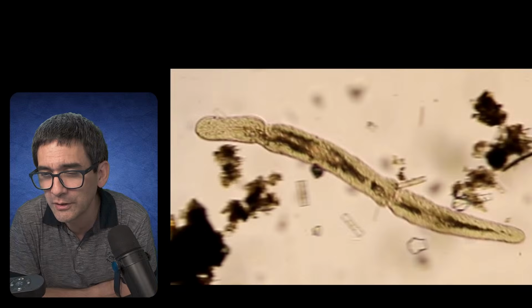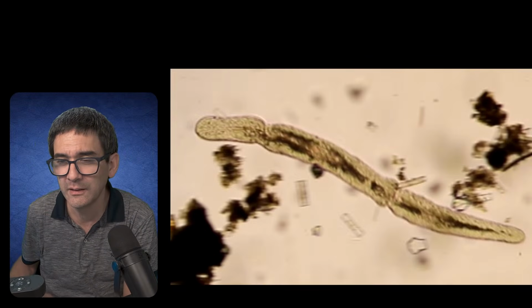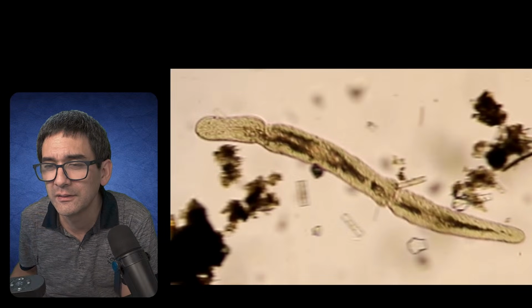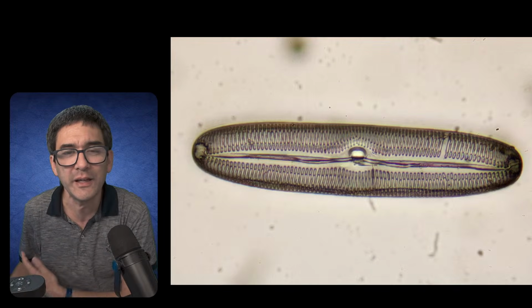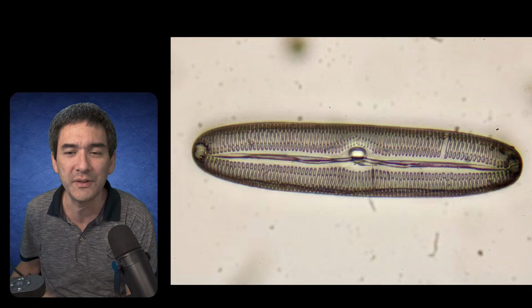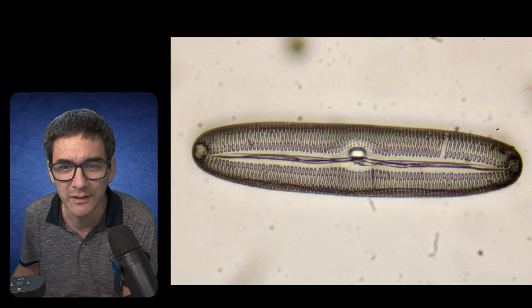Thank you very much. Yes, it's a stacked image of a diatom. Okay. Thank you very much. 25 stacked images. Yeah. So here it is again. I mean, it's just great. It's unbelievable what you're able to do these days, yeah, with a little bit of imaging technology. Yeah, looks really nice.